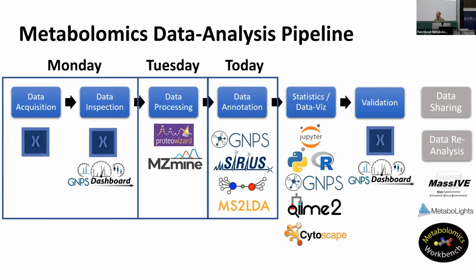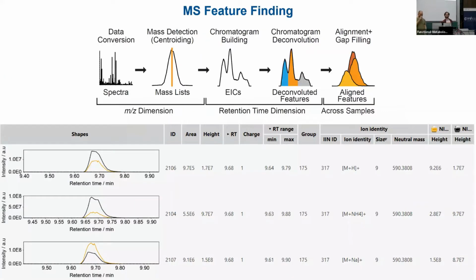And so Robin is going to showcase quickly now the concept. After submitting the job yesterday evening, what actually happened under the hood in GNPS to get you to where you are right now. Okay, so great to see you again.